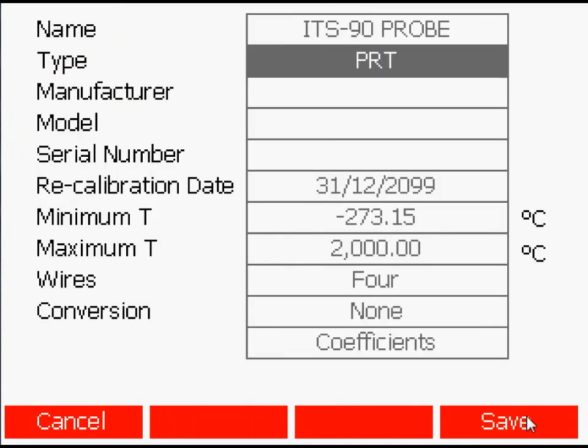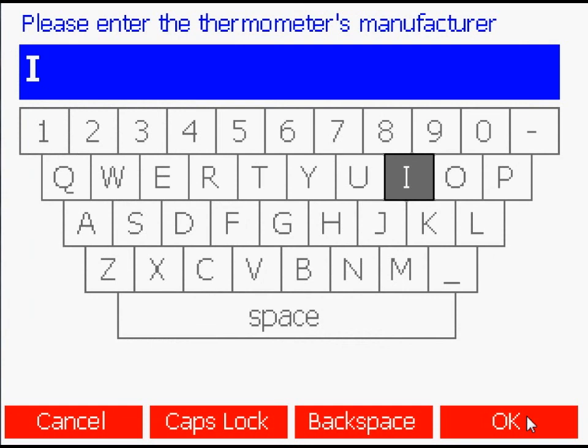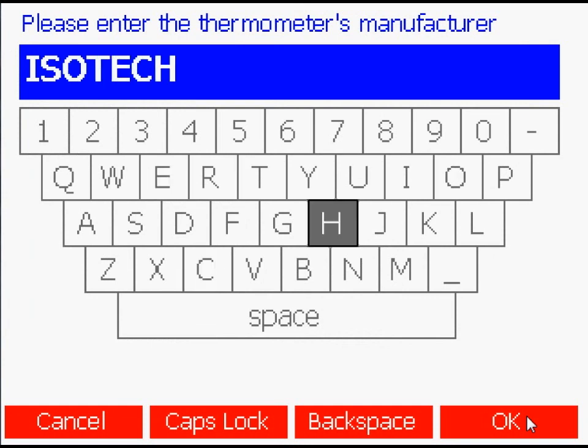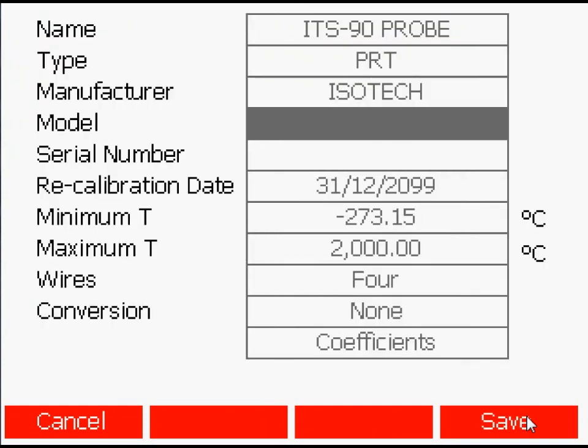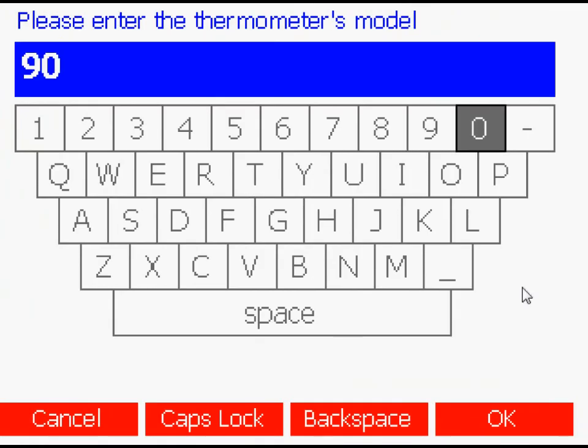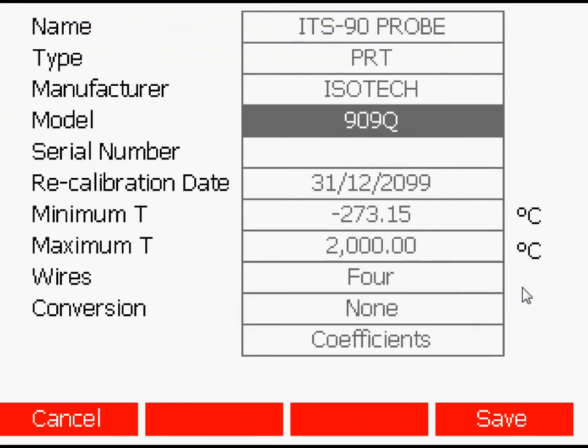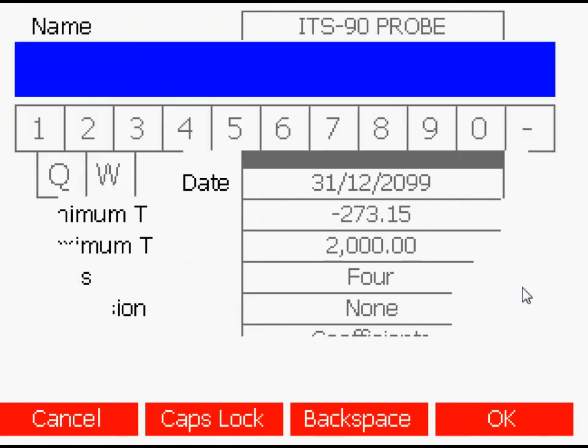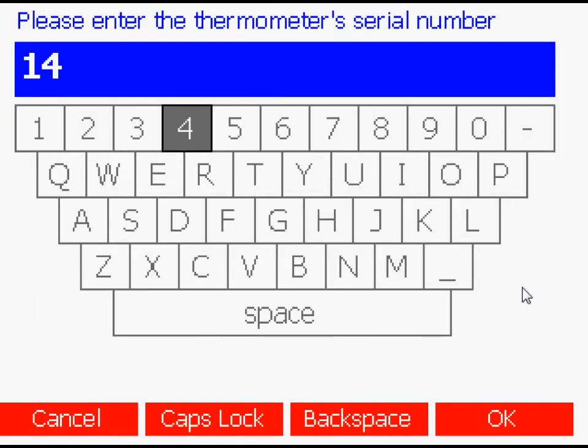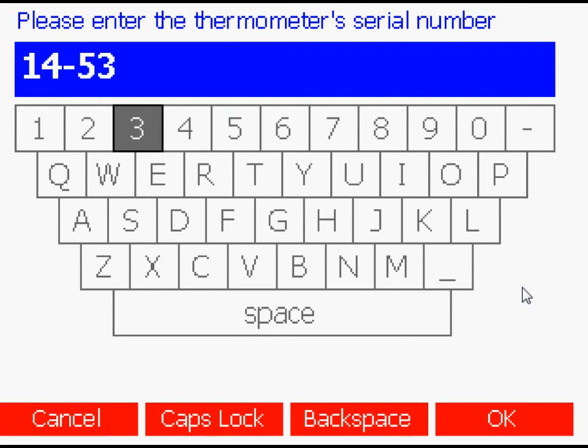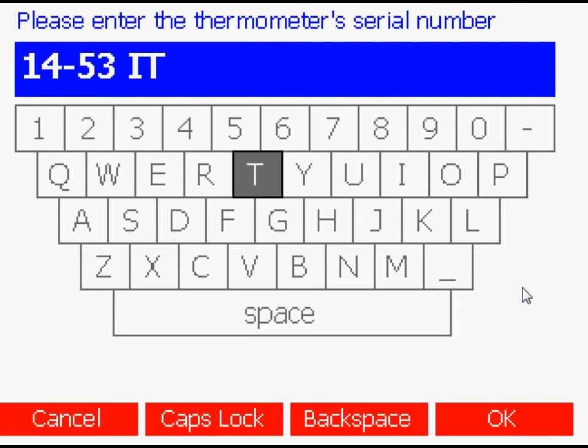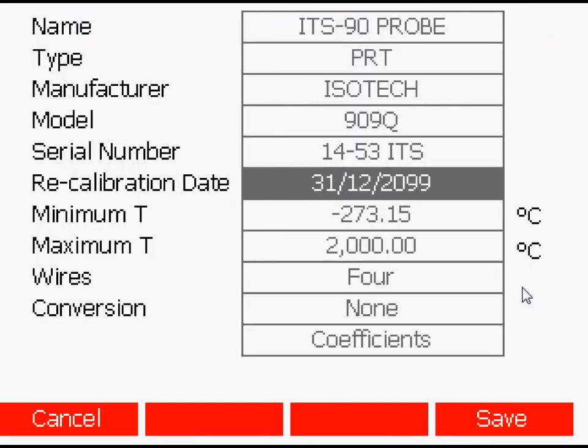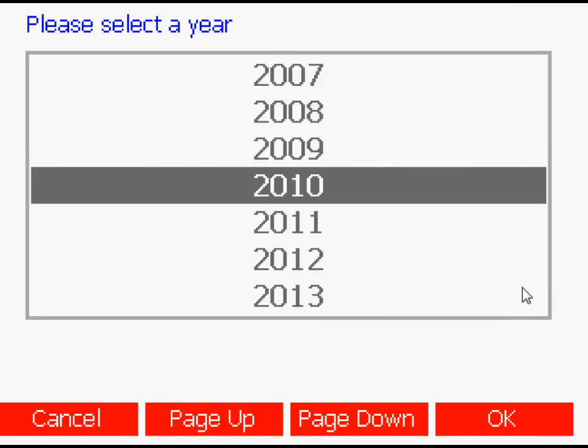The model number of the probe, the probe's individual serial number, the date the probe needs to be recalibrated.